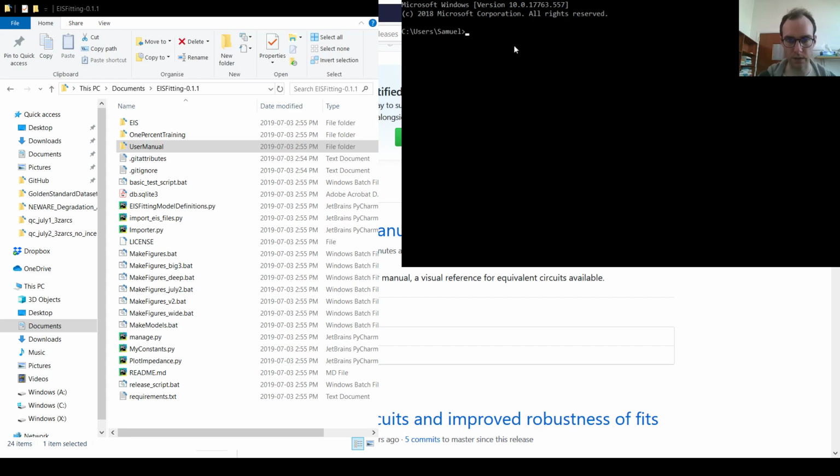So I'm going to assume from this video that you already have a virtualenv on the machine. If this is the case on Windows, you can use the command mkvirtualenv, and then you would give the name of the virtual environment you would want to create.